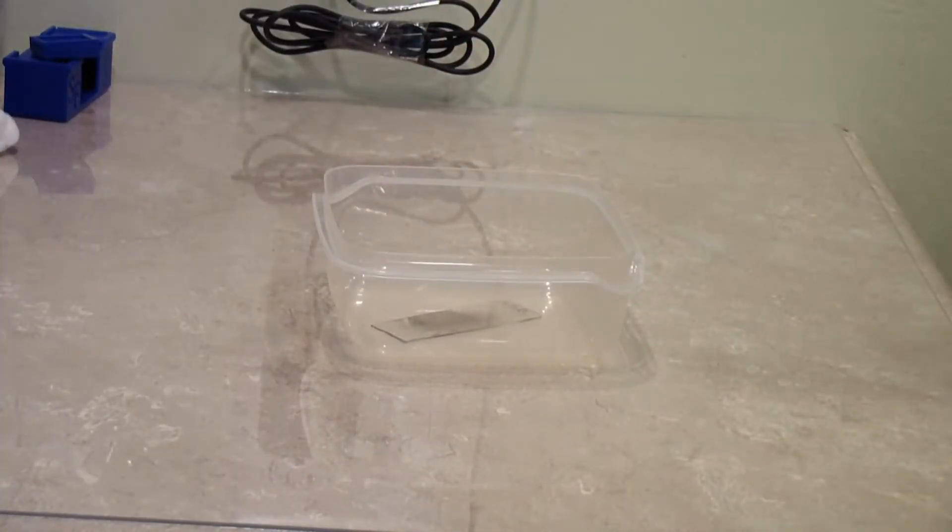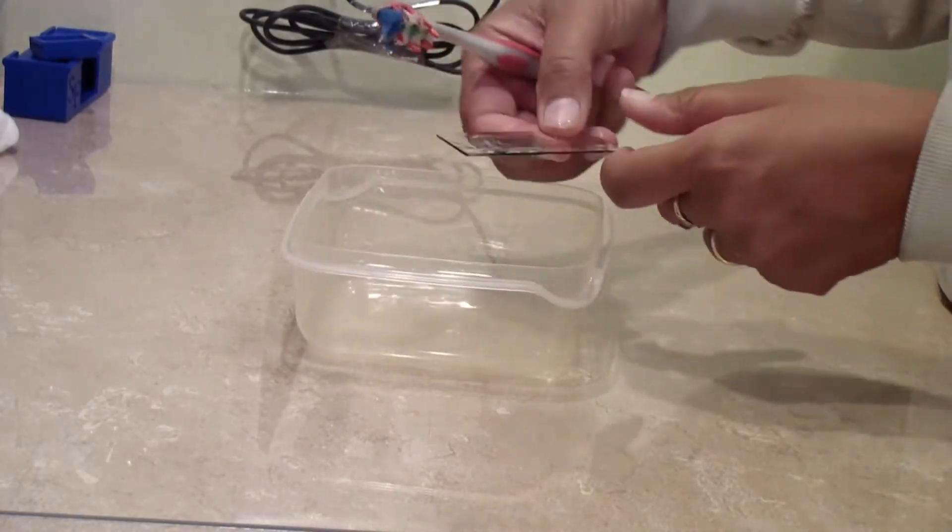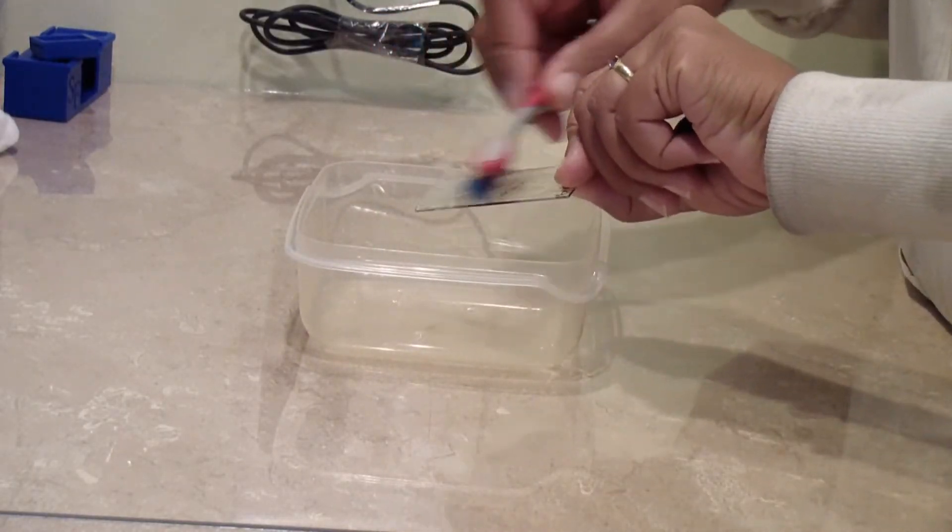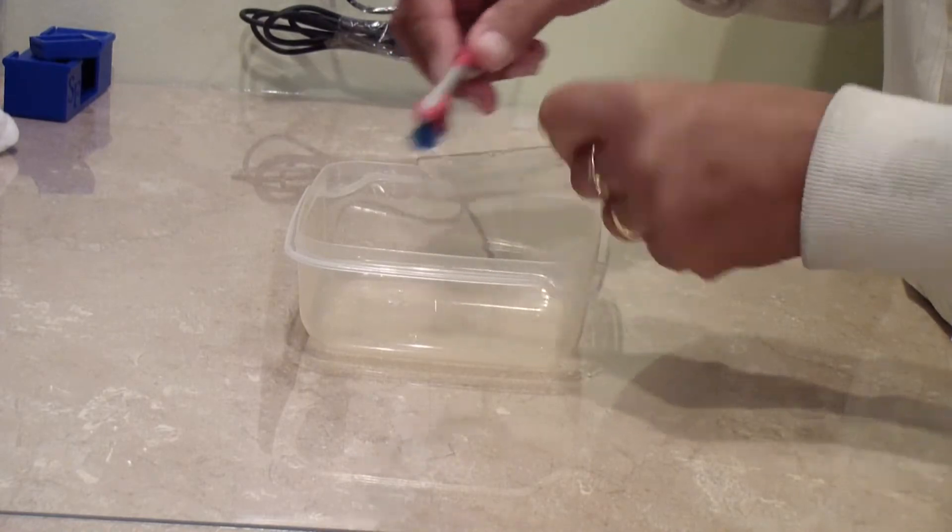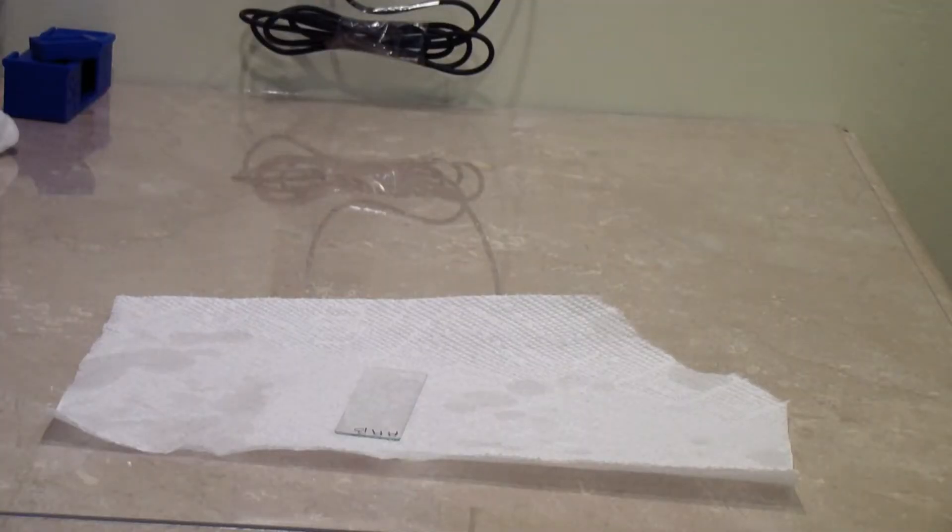Be sure to wait until the slide is cool before you touch it. Once it is cooled off, you can wash the slide by scrubbing it with dish soap and an old toothbrush. Rinse the slide with water and allow to air dry on a paper towel. You can then put it back in the slide box, ready for your next adventure.